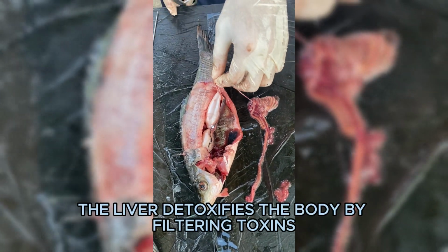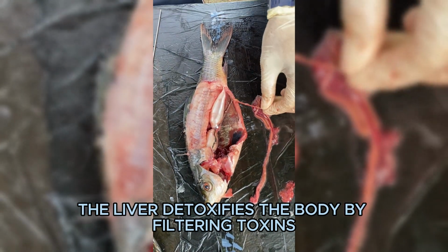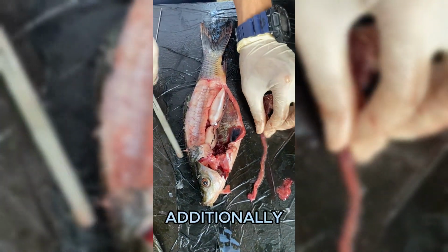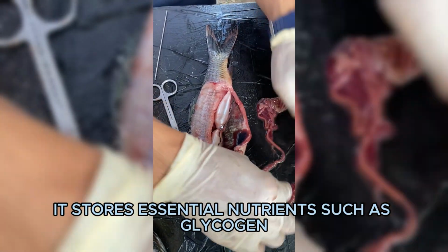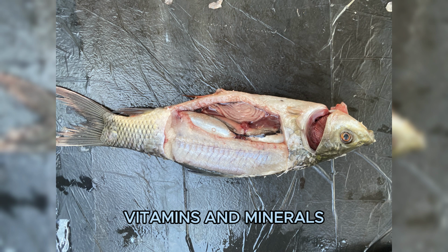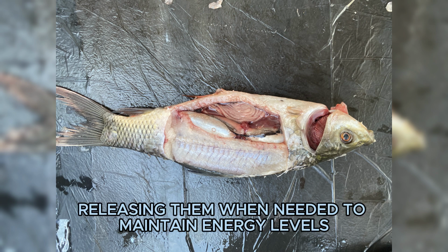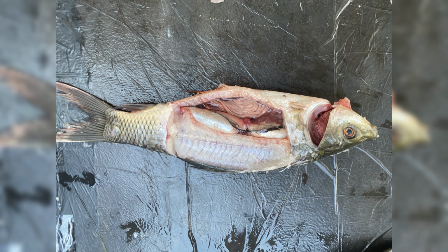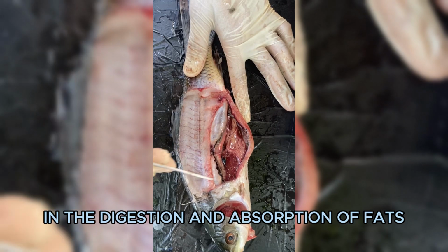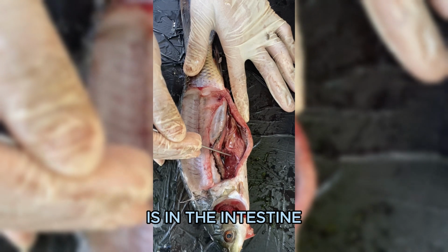The liver detoxifies the body by filtering toxins and harmful substances from the bloodstream. Additionally, it stores essential nutrients such as glycogen, vitamins, and minerals, releasing them when needed to maintain energy levels. The liver's production of bile acids aids in the digestion and absorption of fats in the intestine.